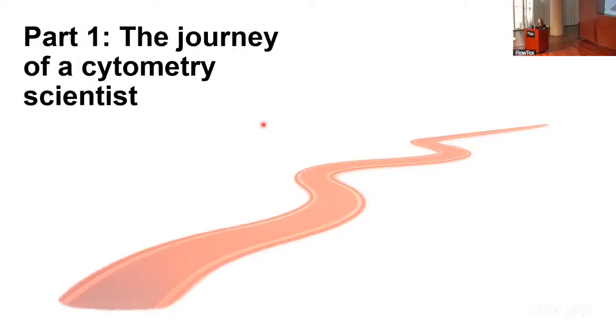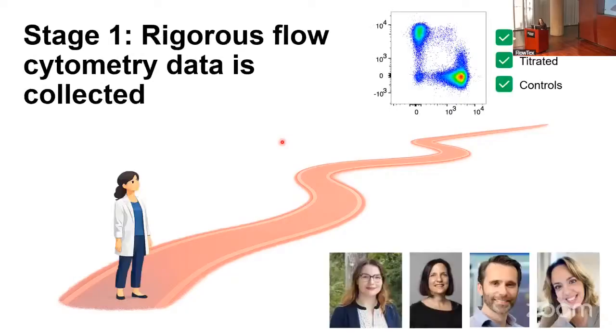And I think from the presentations this morning, it's a reminder of how challenging this journey really is and continues to be, even for those of us that have been in this field for a really long time. But that is the challenge that all of us in this room have accepted. And so we must start somewhere, and that is the collection of rigorous flow cytometry data. Every cytometrist will always start with something like this, no matter what their presentation is about. You will never regret collecting fantastic data if you put the work in up front. You will save so much time in the end.